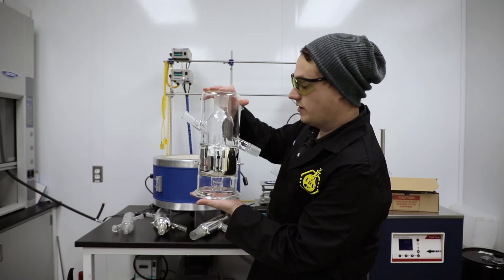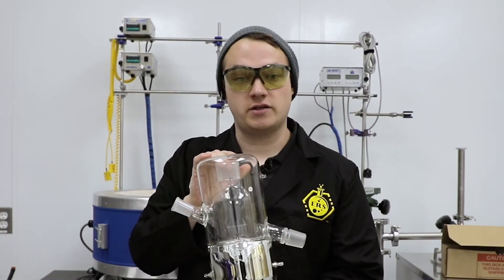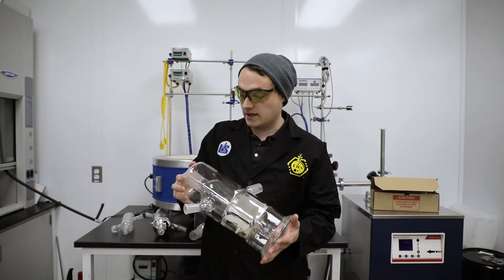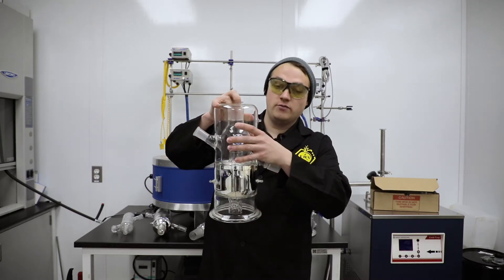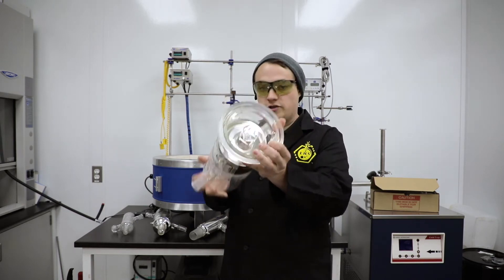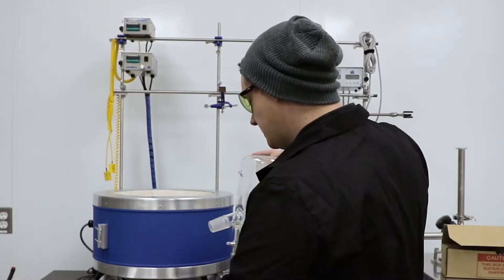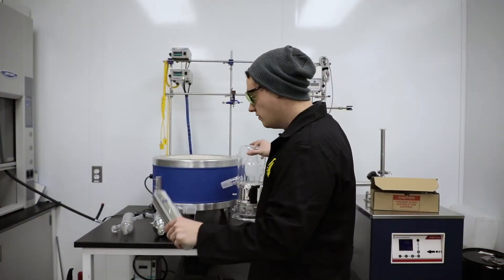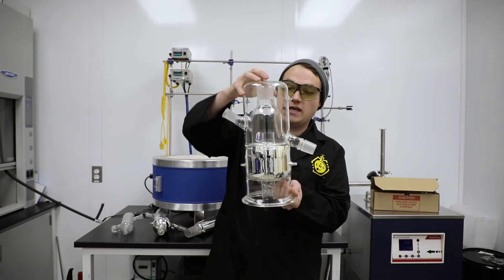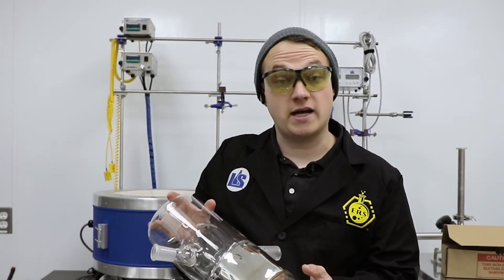From here, we've got this big one, which is a reactor flange head. This head was never actually released to the market — some of you may have seen this at Vegas in 2019. We did a lot of testing on this head, with and without a vacuum jacket on top. The big thing about this head is that the size of that up-tube, which is approximately 45 or 50 millimeters, is actually the same size as the up-tube in the smaller head. So we really didn't see a whole lot of increase in speed with this distillation head, even with the larger pre-condenser, and we ended up not releasing it and going back to more testing.